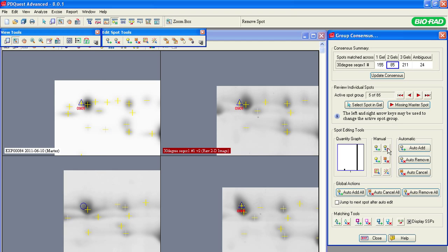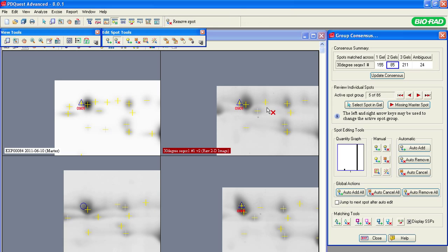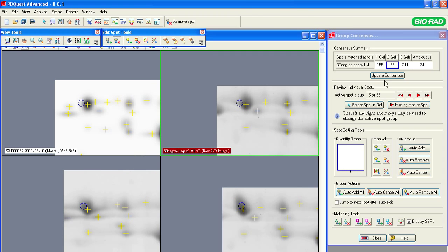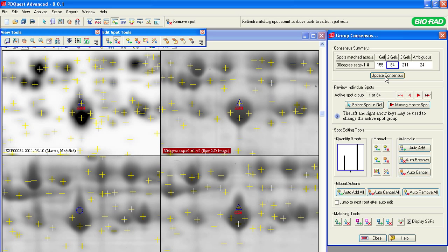Use the manual spot editing buttons to add, remove, or combine spots. For example, here is a spot that should be removed. At any time during spot editing, you can click the Update Consensus button to have the changes you have made take effect and see if the consensus value of the group has improved. Once you have finished your review with the consensus tool, you have cleared the errors in detection and matching of the protein spots and have improved data quality in your experiment.